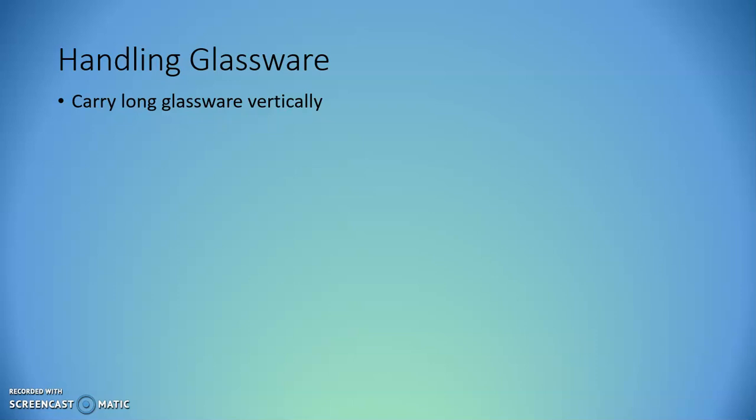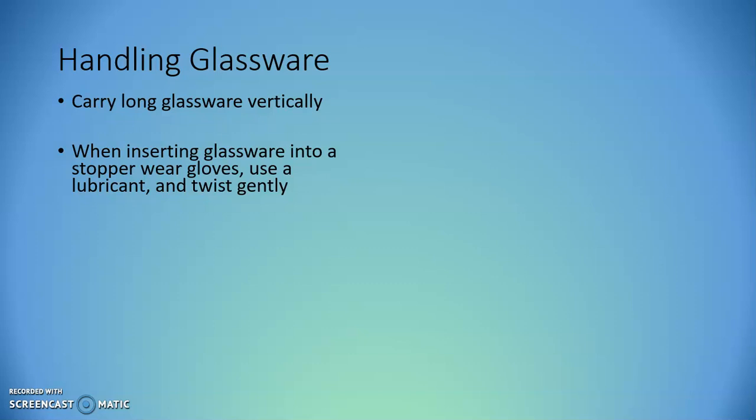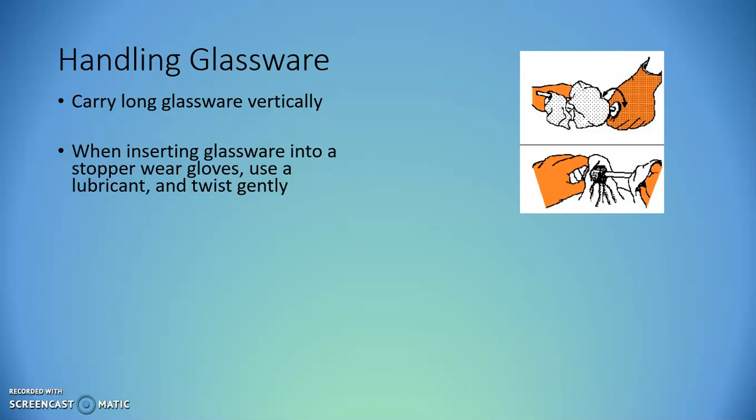If you have a glass tube or a glass rod that you are carrying, you want to carry it vertically in front of you because you're much more aware of what's going on in front of you than off to your sides. If that glass rod needs to be placed into a stopper, you should make sure you're wearing gloves, have it slightly lubricated so it slides more easily through that stopper, and do so in a gentle twisting motion, as you see here, wearing those orange gloves, twisting that glass tube into the stopper to insert it completely.